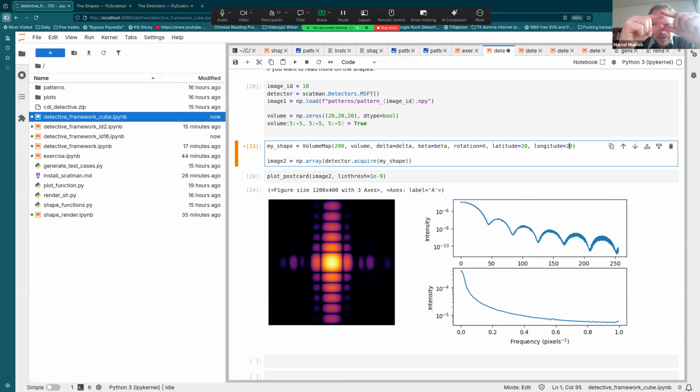So also if you have some kind of ellipsoid, for example, or a sphere, which is first of all spherical, but then you flatten the North Pole and the South Pole, making them a little bit flat surfaces, so they start to produce two small parallel surfaces, then immediately this creates an elongated streak in the diffraction pattern.